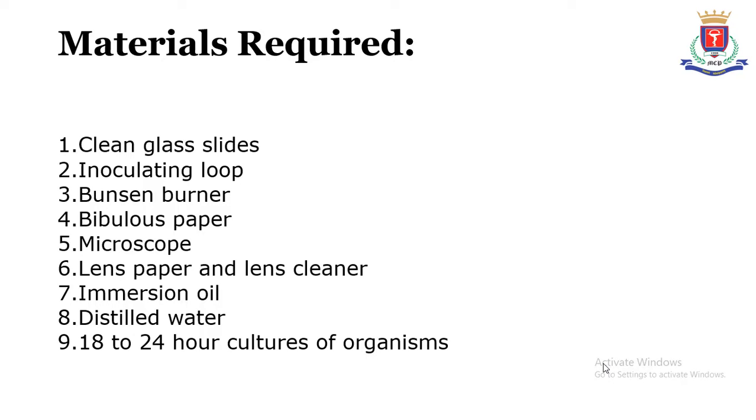The lens cleaner is used in order to clean your objective as well as eyepiece lens. Immersion oil: in case of immersion oil, you can use either white paraffin liquid or cedar wood oil. Distilled water to clean or wash the slides, and 18 to 24-hour cultures of organisms.